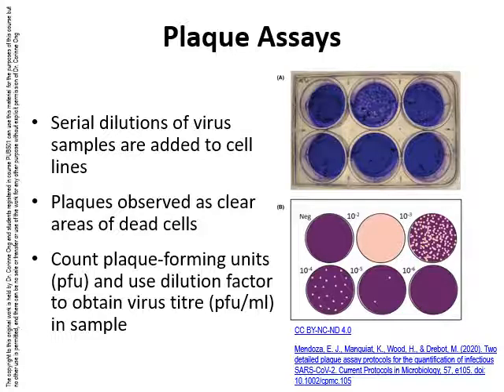In the next well, in which a 1 in 100,000 dilution of the virus was added, there were only 2 plaques. In the last well, the virus sample was diluted by 1 in a million, and no plaques were observed, indicating the absence of SARS coronavirus 2 plaque-forming units.